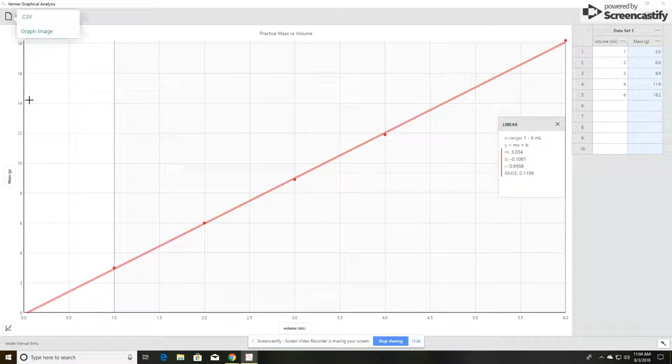But here you can see we've just gotten great data. And if you want to just capture it, just do a print screen and capture it that way. So bottom line is, this is a great method to use. It gives you great data, and you can find all kinds of information. And I've only hit the tip of the iceberg with this program.